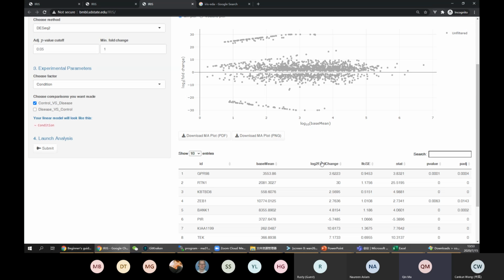In such a situation, we just adjust our p-value. The procedure is very, very simple: we just make the cutoff more strict. For example, using the original p-value cutoff, you can select the top 100 genes as statistically significant ones. But after adjustment, you can maybe only select 56 or 70 something. They will not change the order of the differentially expressed genes. They just give you a more strict p-value cutoff, so you can only select part of the first 100 genes. That's basically what p-value adjustment means.